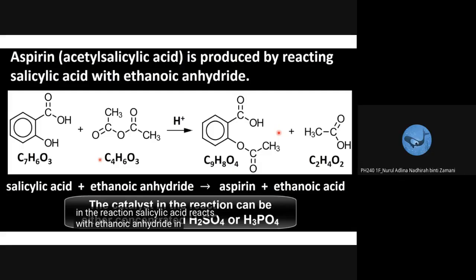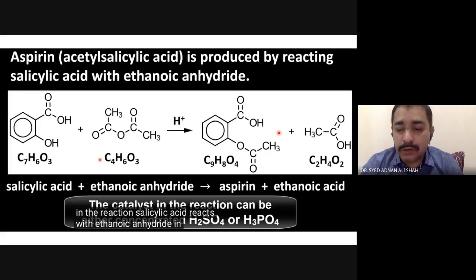Yes. So generally, molecules which have the property to form hydrogen bonding have higher melting point as compared to molecules which have weaker hydrogen bonding or no property to form hydrogen bonding. They have a low melting point. So one method is melting point.